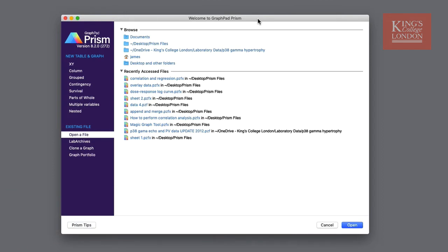The first thing you'll see when you open Prism is the intuitive Welcome to GraphPad Prism window. Within this window you have the options to create new tables and graphs or open existing files from one of many sources. There is also a useful link to the online Prism manual known as Prism Tips.